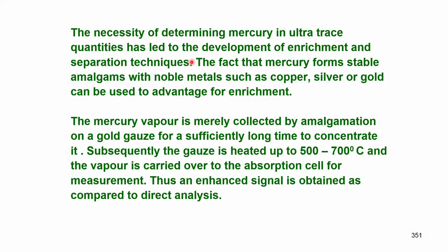That means the absorbance reading you get would be different than what it should be. So, the first one will be less, the second one will be more, the third one will be much more, and like that the whole calibration curve can get biased. This should not happen. So, an enhanced signal is normally obtained and that is carryover.